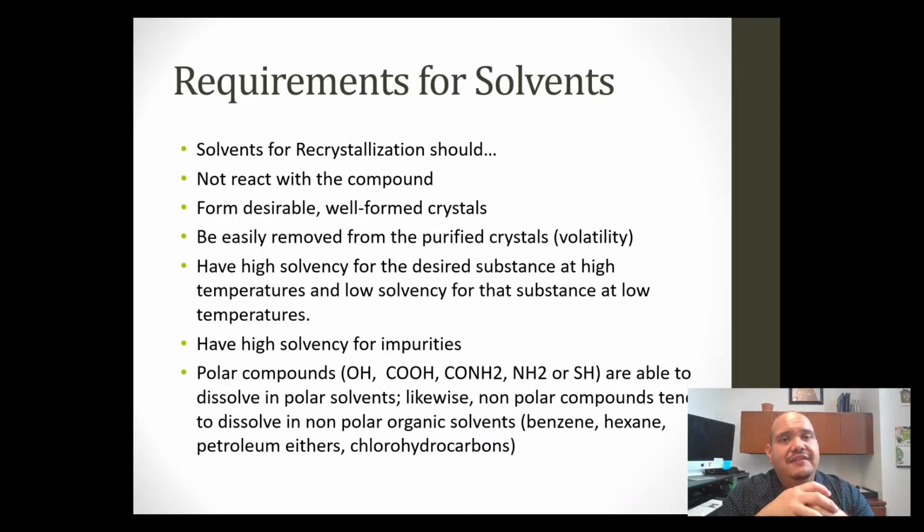You don't want your solvent to sit on your crystal. You don't want it to just go stagnant there, because if it does, you are not going to be able to take the solvent out. And at the end, you want to dry the crystal because you need to get a melting point, and you can't get a melting point on a wet crystal. So solvents are best volatile, but not so volatile that they vaporize away your solute.